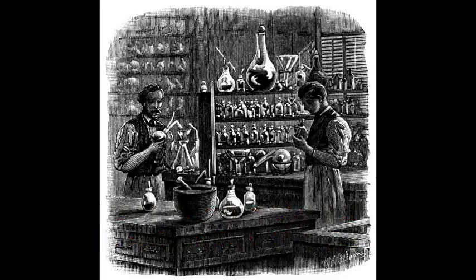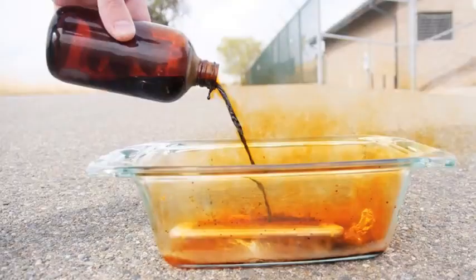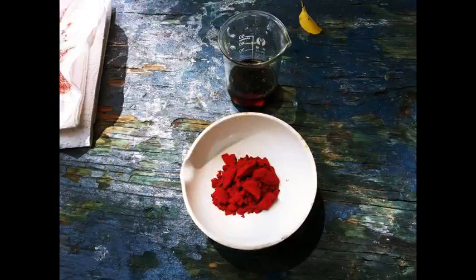This first video will show how to produce bismuth trioxide from bismuth metal. The second video will show how bromine is synthesized from alkali bromides. The third and final video will be the actual synthesis of sodium bismuthate from bismuth trioxide, bromine, and sodium hydroxide.